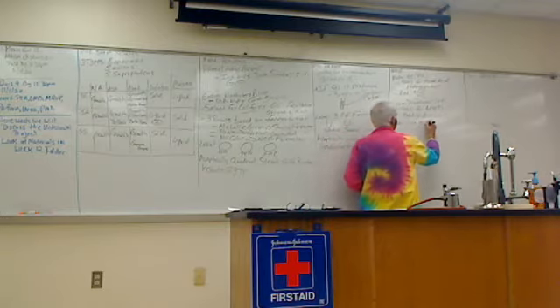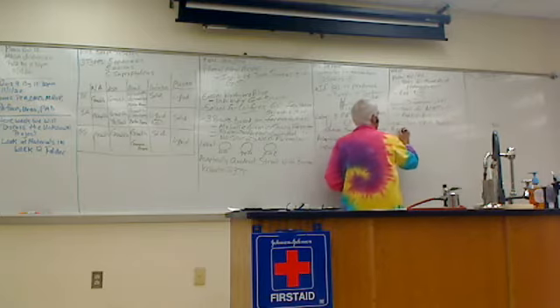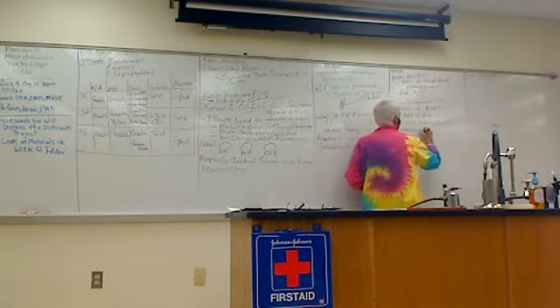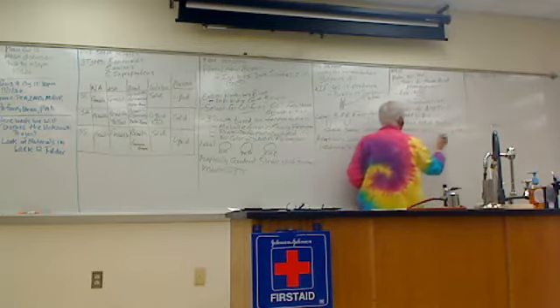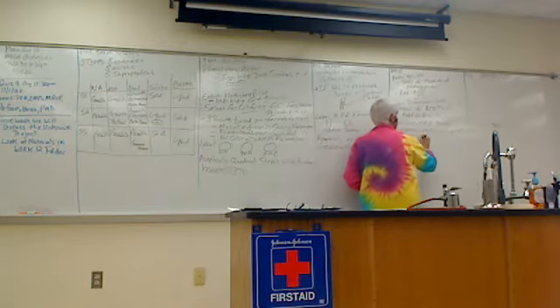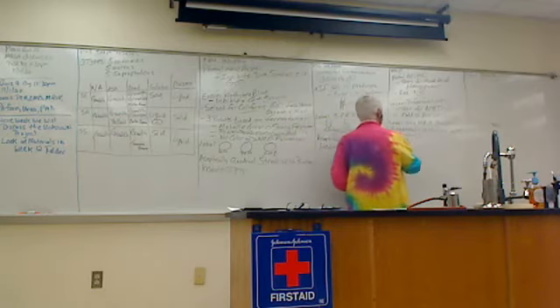1 MRVP broth and aseptically inoculate your bacteria, and then we're going to incubate this also at 37.